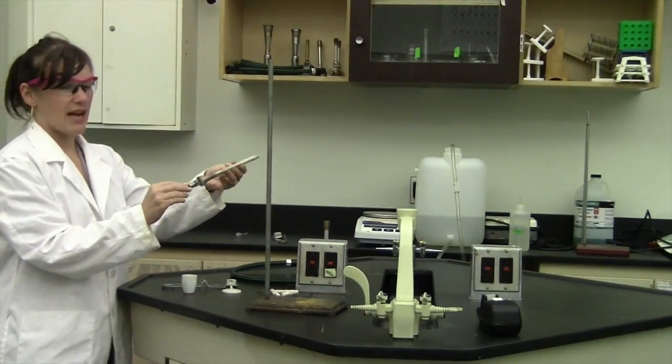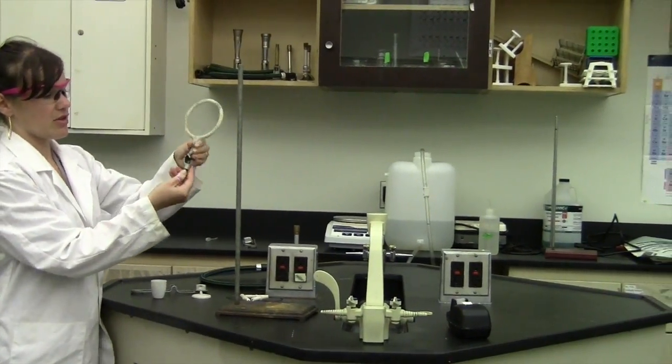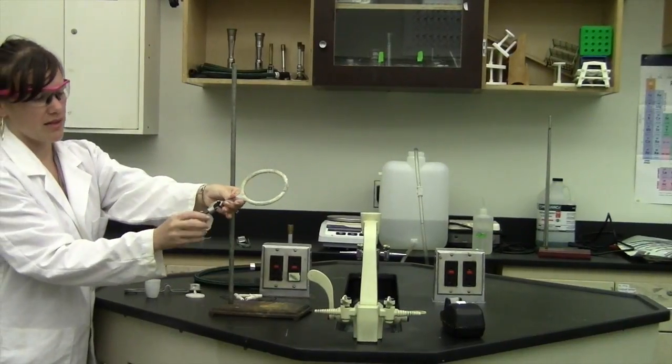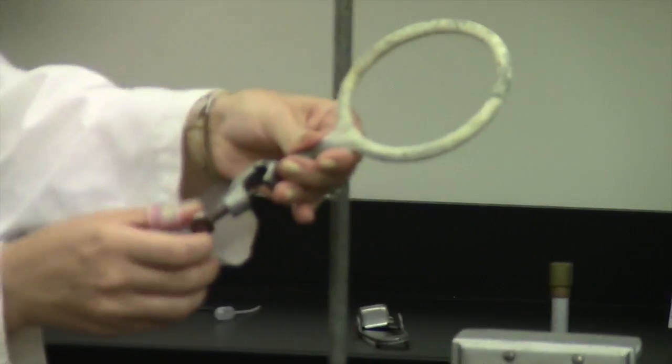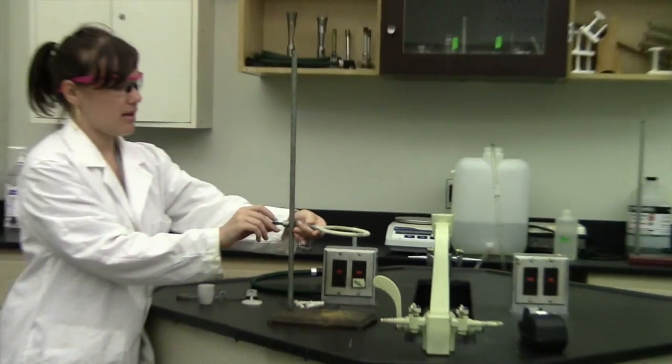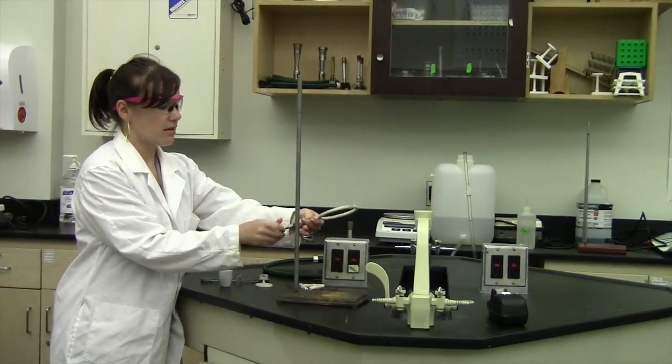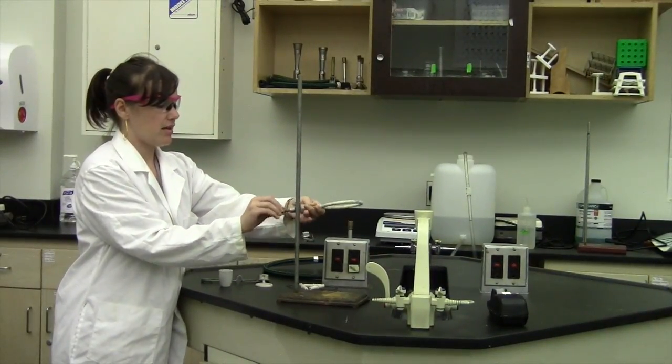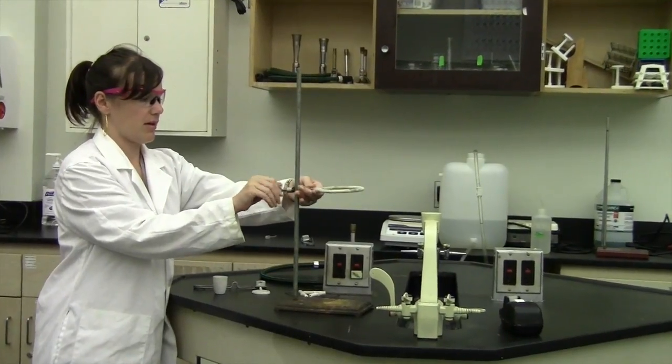So we're going to attach the ring. You'll just unscrew this part of the clamp, lefty-loosey, and then it's going to go in and you'll tighten it righty tighty. I'll put it above here.